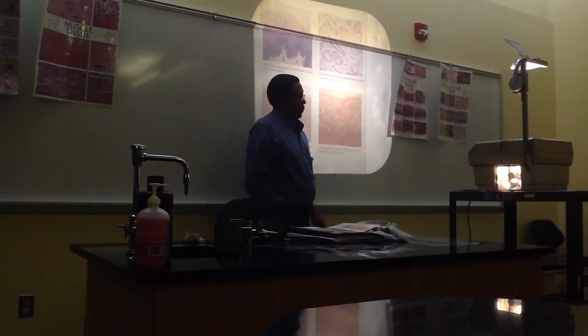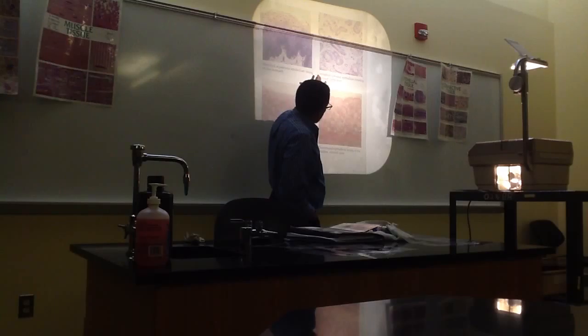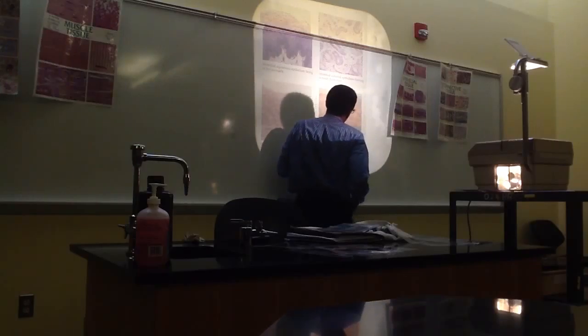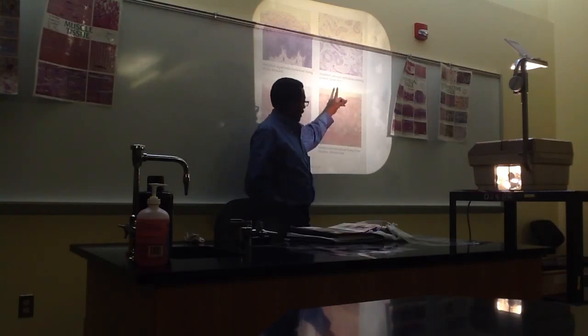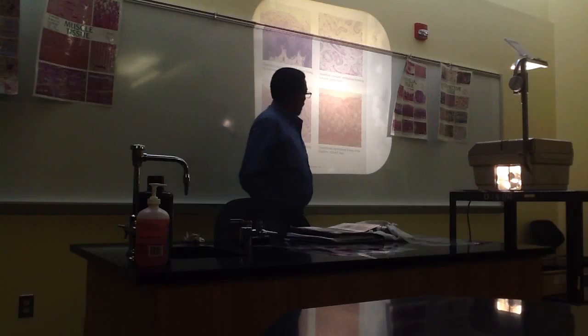So if they stretch, they sort of look squamous, I guess? A little more, they won't stretch that much. They'll probably look less flattened out. They'll probably look kind of cuboidal, but further apart. But again, the best identifying thing to me is to look for these big borders along the free edge, because you could interpret this in a number of ways. But that will be the tip off. Okay.